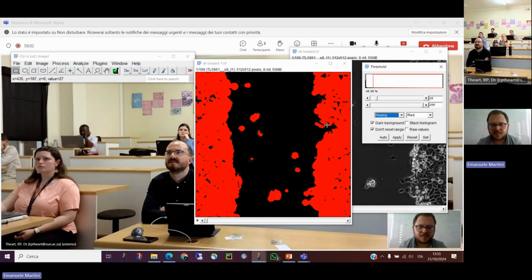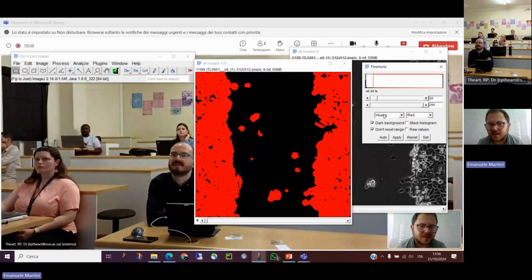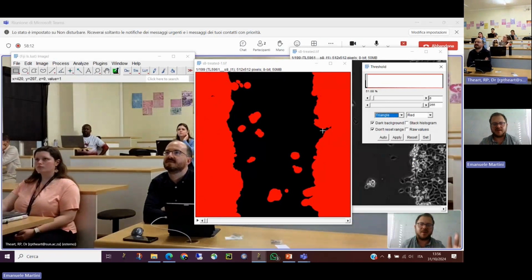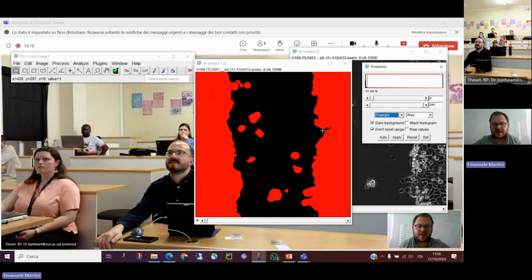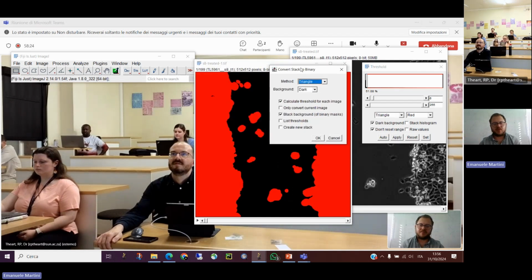When you are happy with this, let me go back. I think I put triangle at the end. Sorry, let's try with triangle to keep everybody on the same page. Okay, triangle is better indeed. When you are fine, you click apply. Now you stop. You click apply and wait. We have to do a discussion about it.